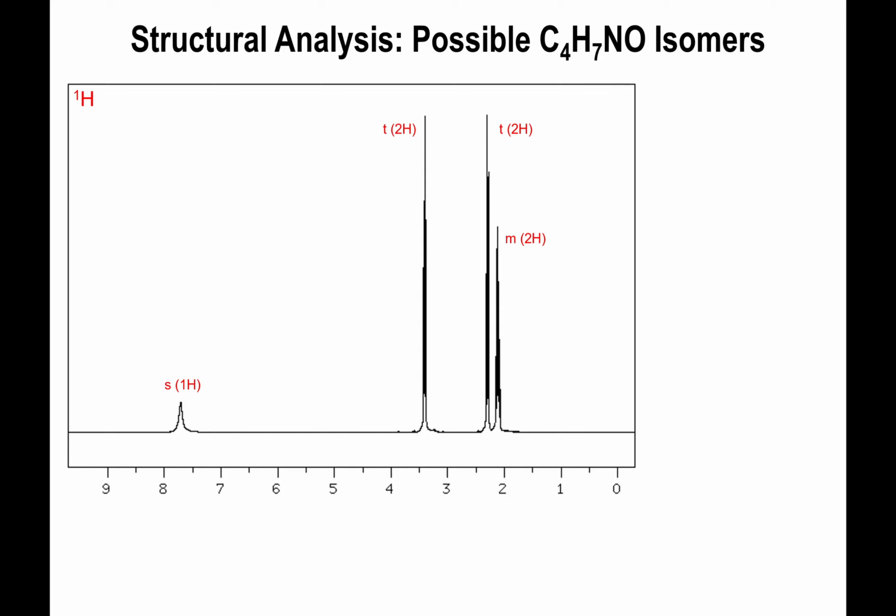Okay, so here we go. This is the proton NMR, and we're going to bring back the 3 possibilities to which we've narrowed it down. All right, so let's take a look at the spectrum. What I want you to notice is that you have 4 different peaks because there's 4 different kinds of protons in the structure. Okay, but the other thing too is the integrations. Notice that this broad peak that falls between 7 and 8 integrates to 1 proton.